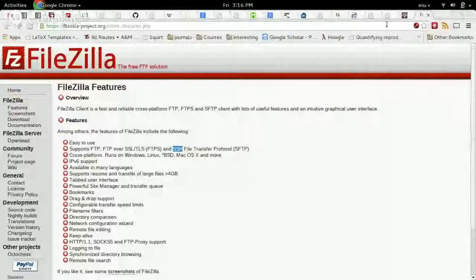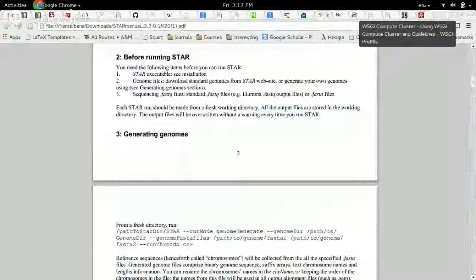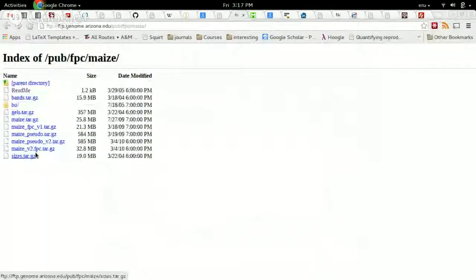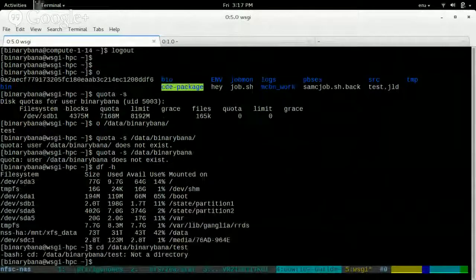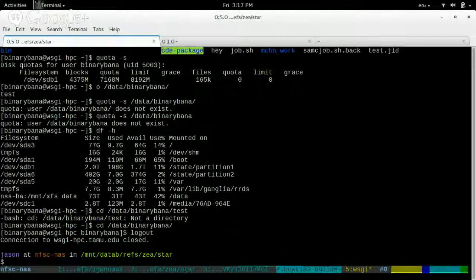Although actually, since you already have the data right on the other server, you'd just go onto the cluster into your data folder and say wget huge file, basically, and then it would put it straight into your 2 terabyte quota directory. Does that make sense? Yes. Okay.